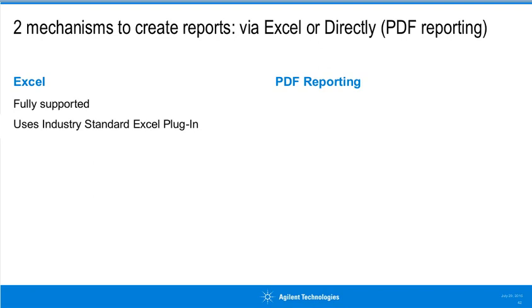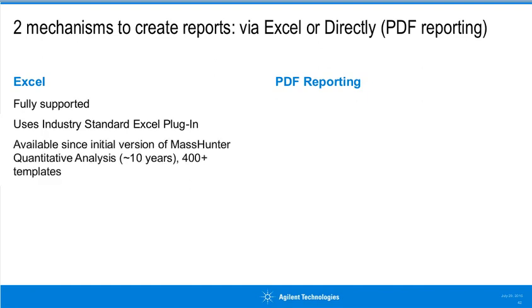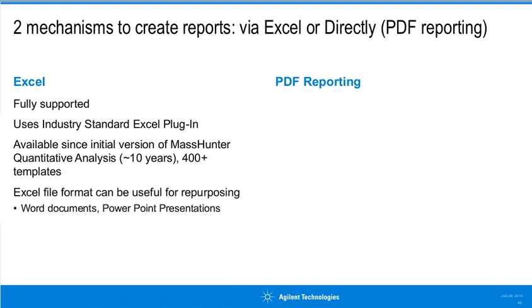And the reason for that is that in addition to using the industry standard Microsoft supported plugin, we recognize that Excel-based reporting has been around for several years and that there are quite a few templates that are in use, over 400 in fact.